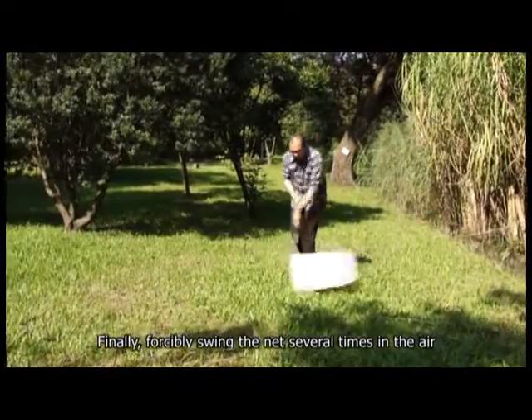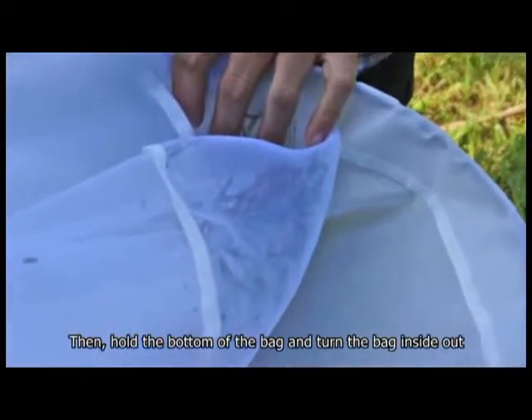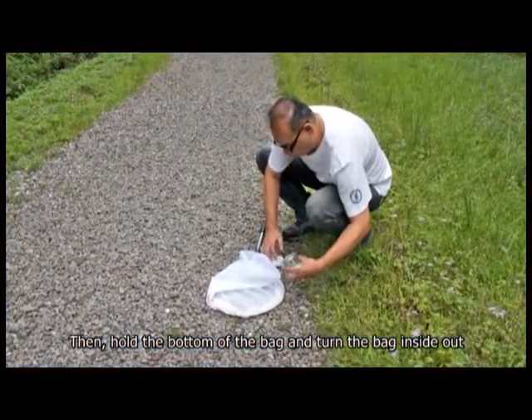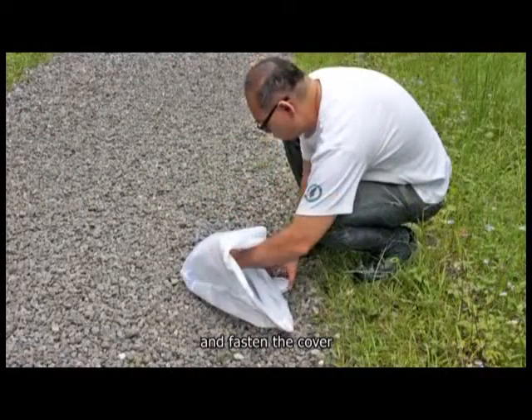Finally, forcibly swing the net several times in the air to let all insects and plant material gather at the bottom. Then hold the bottom of the bag and turn the bag inside out to quickly stuff everything inside the killing jar and fasten the cover.